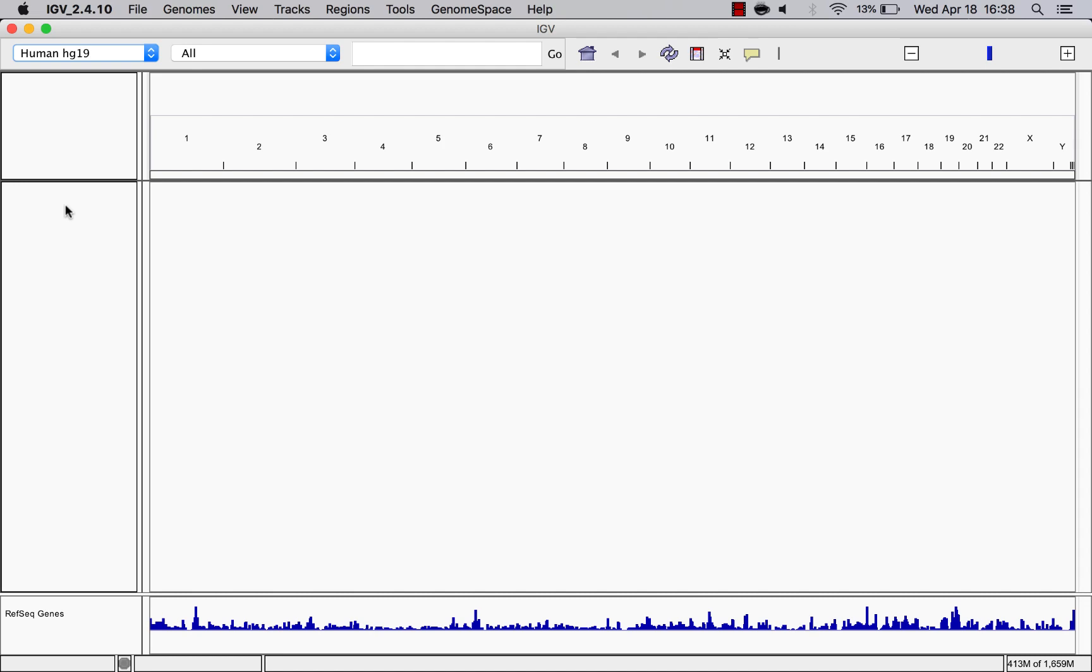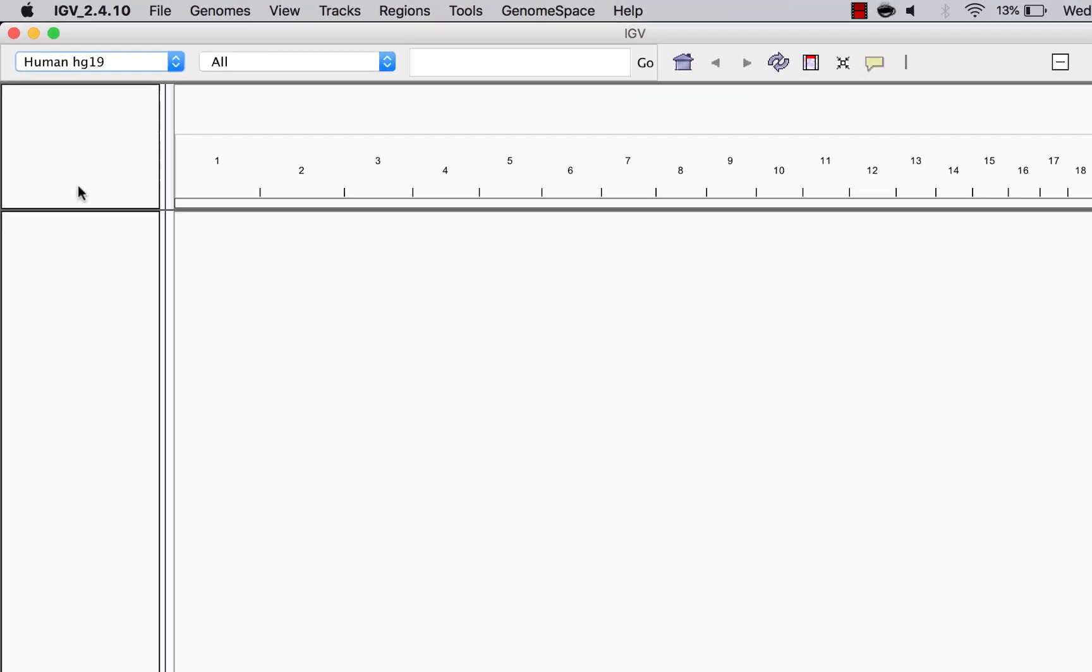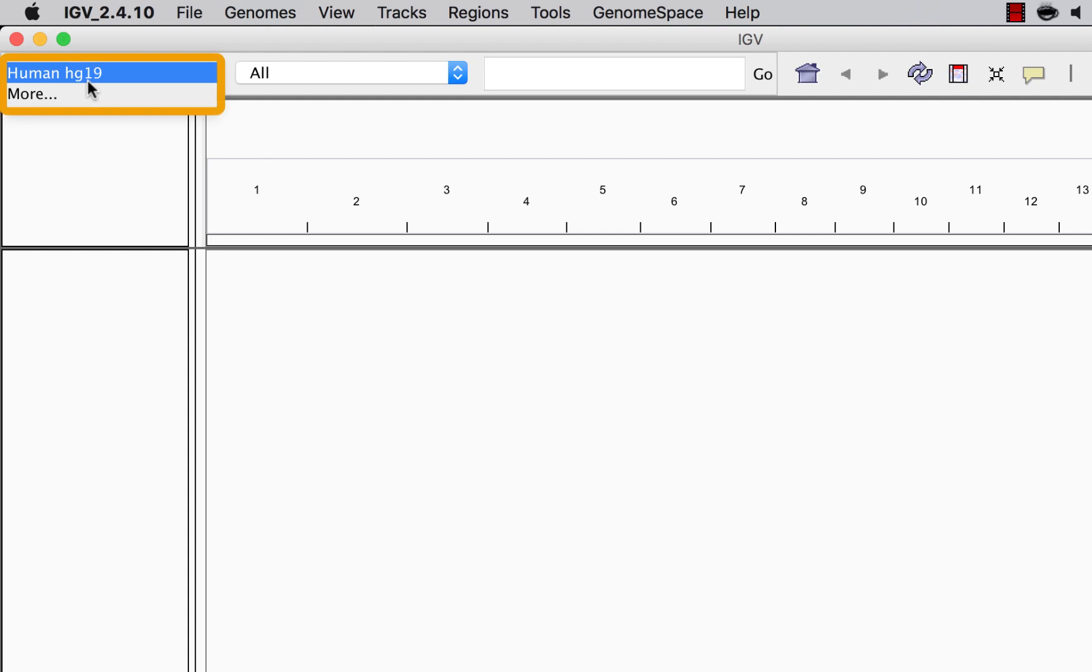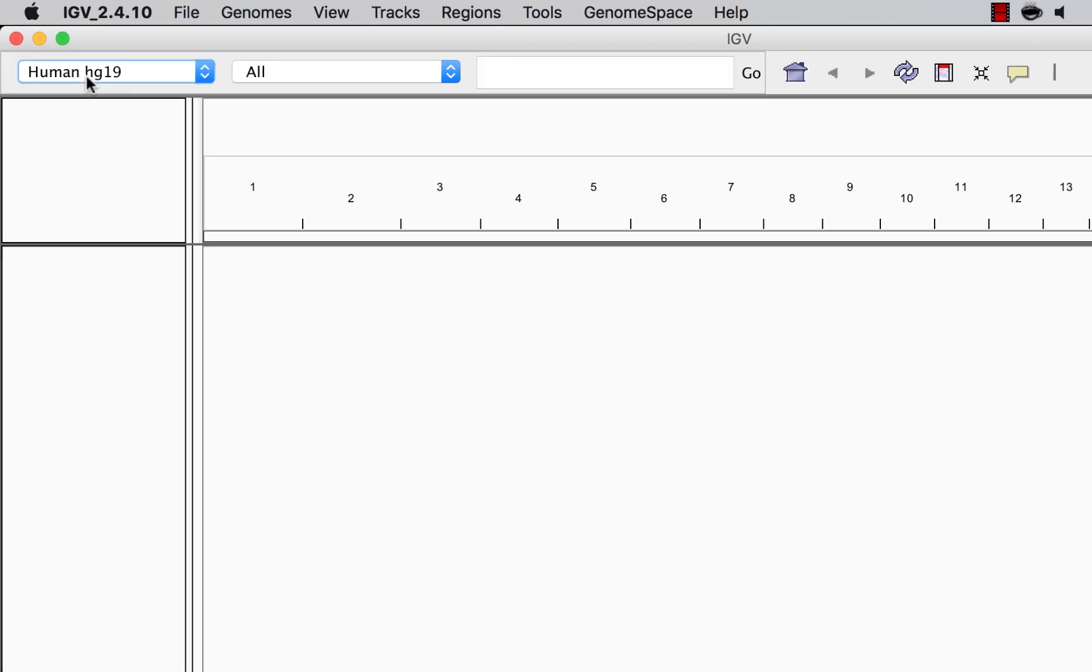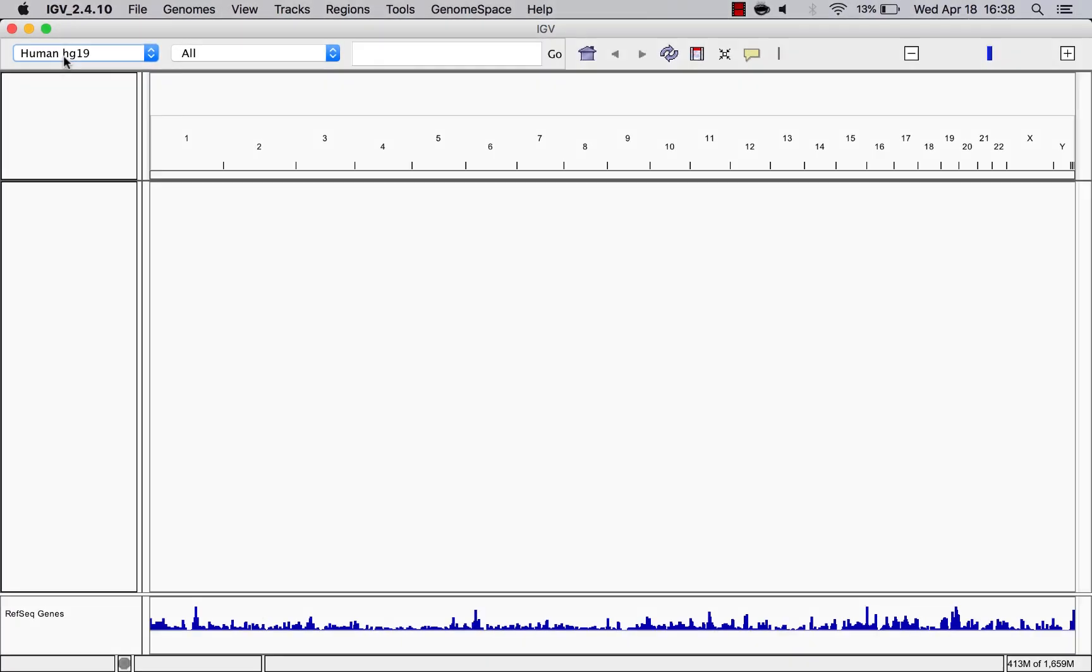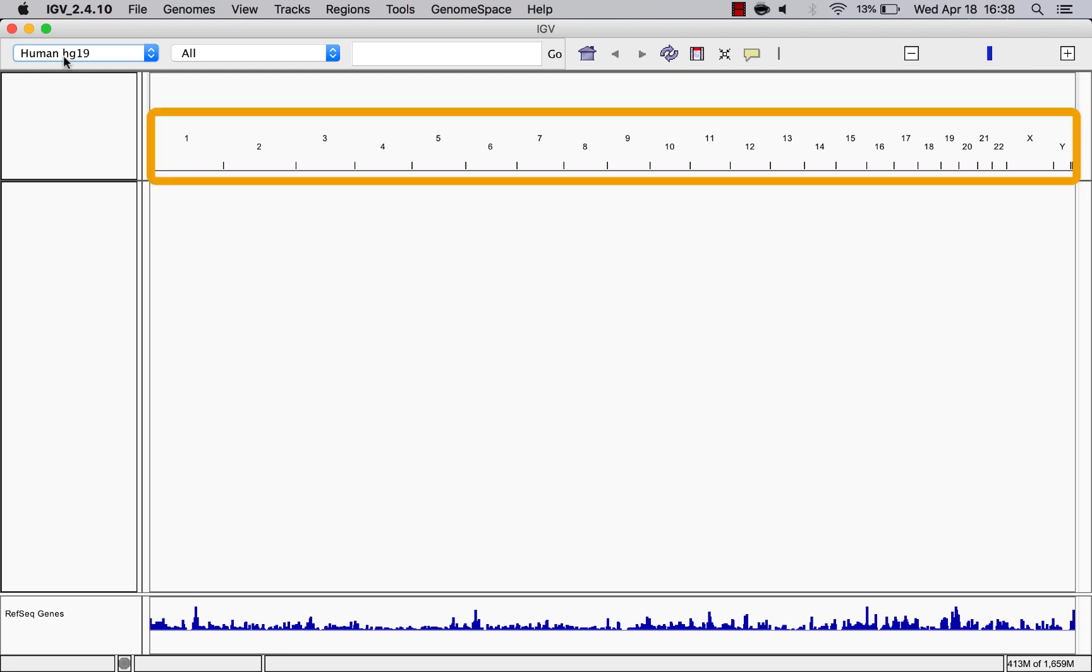After launching IGV, you can select a reference genome from the dropdown on the upper left. Here we'll use Human Genome 19. After selecting a reference genome, it'll appear here in the genome ruler.